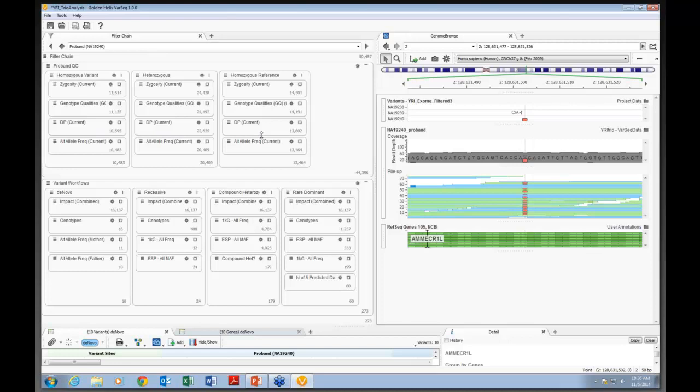Here, the layout has a few more levels in it. Whenever you see side-by-side boxes, it indicates three parallel processes that ultimately are using OR logic to connect them. So we're looking at the union of three things.